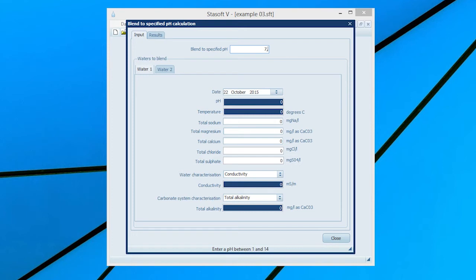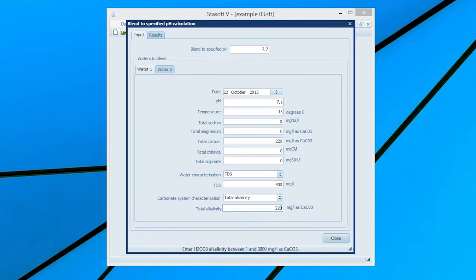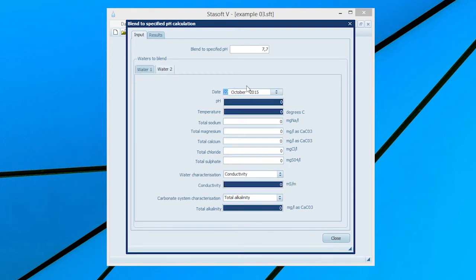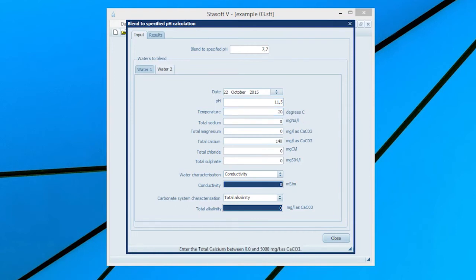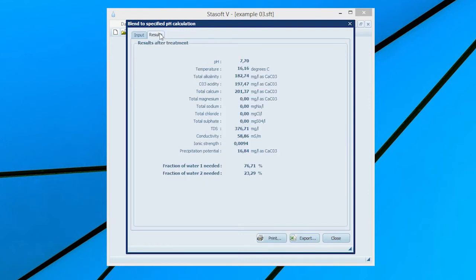Enter the desired pH value by typing 7.7 into the desired pH of blending water input box and then complete the dataset as provided in Example 4 of the manual. Selecting the Results menu option will bring the Results After Treatment window onto the screen, with values for the final state of the blended water and the fraction of each water required to give the prescribed pH.